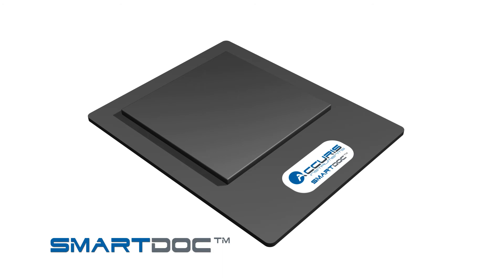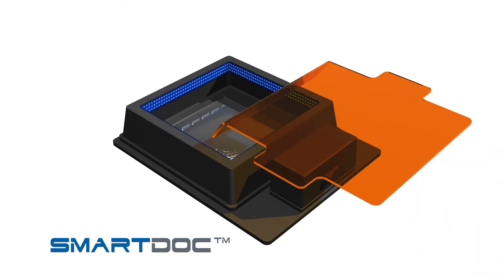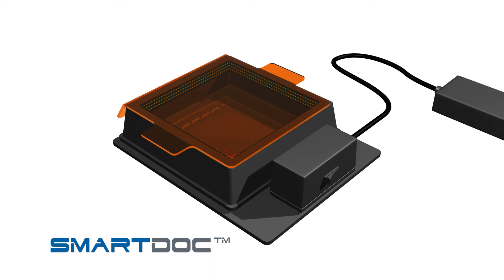After running and staining your electrophoresis gel, place the gel onto the center of the gel platform. Fit the blue light illumination base and orange filter cover on top of the platform, then connect the included 12-volt power supply and press the power button.